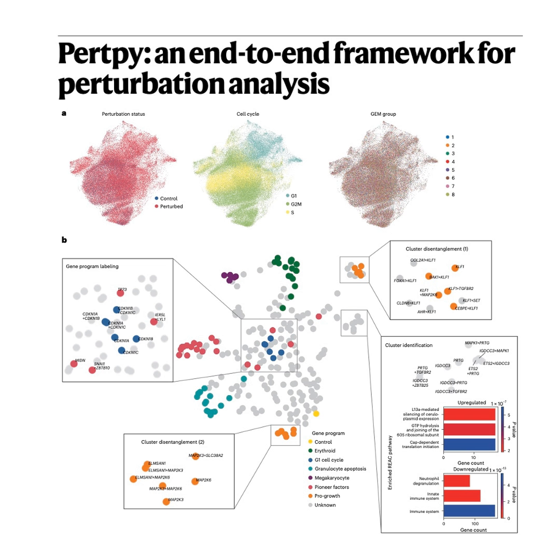And that's the revolution. We're talking about these huge, high-throughput experiments, things like Perturb-seq, CROP-seq. Right. Researchers aren't just looking at one thing at a time. They're hitting thousands of cells at once with different genetic tweaks, different drugs or disease states, and then capturing the response of every single cell. And when you start doing that to millions of individual cells with thousands of different stimuli, you get these absolutely gigantic, complex data sets.